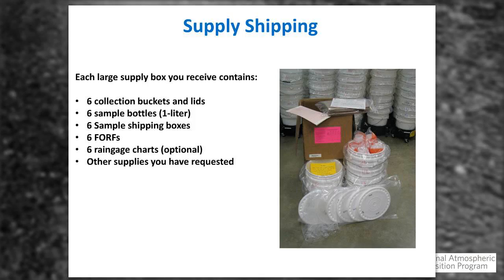These aren't just common buckets. We acid leach them at the beginning and carefully wash them. So we like them wrapped because it prevents scratching from one bucket sitting in another, because we do reuse them many years. So contact us if you have any questions about material reuse. There's also analysis on the bags as well. We do. We check all of this. This is a slide we'll see in a minute.